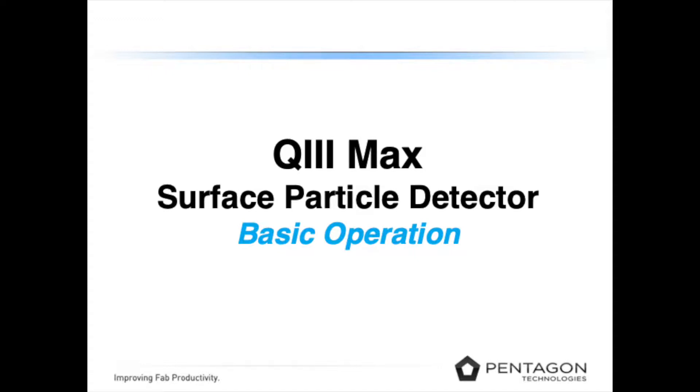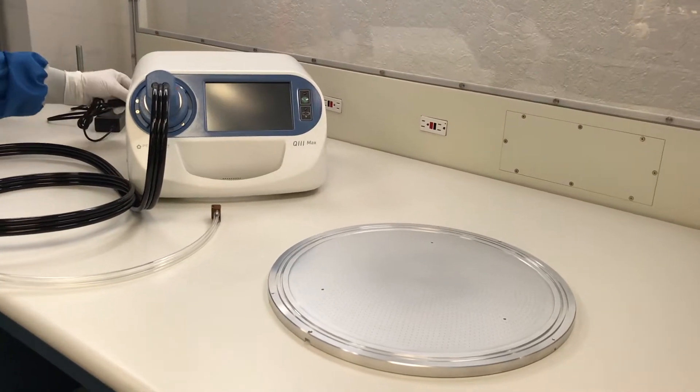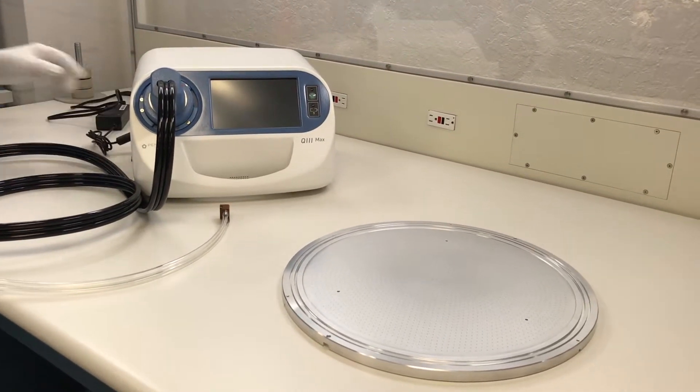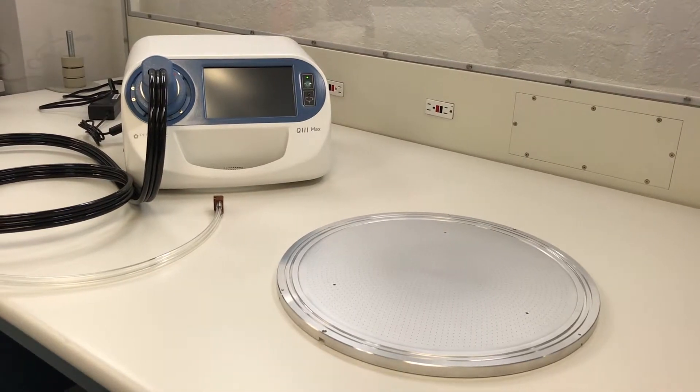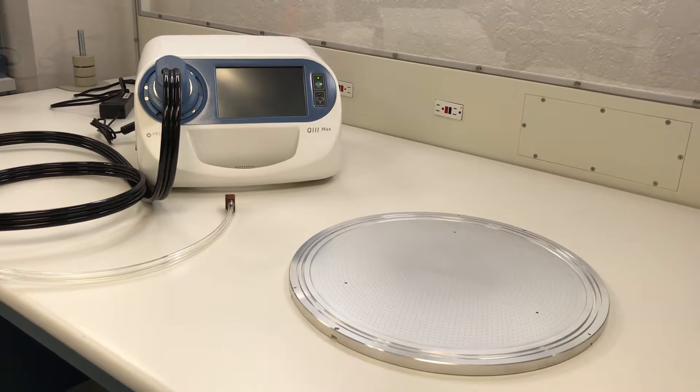Hello, this video shows the basic operation of the Pentagon Technologies Q3 Max surface particle detector. The first step is plugging in the Q3 Max. The Q3 also comes with two hot swappable batteries, however for this demo we are running off of AC power.